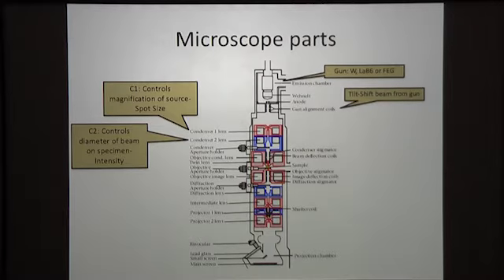In addition, we have deflection coils in the microscope. Now, although mechanically all the lenses are put onto the microscope and assembled so that they kind of line up, we still have to shift the beam and tilt it around in certain places. So we have these deflection coils, which you can think of as mirrors for light microscopy, which will bend the beam and shift it in different places.